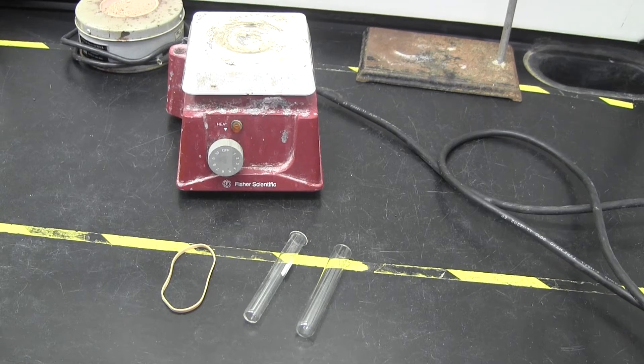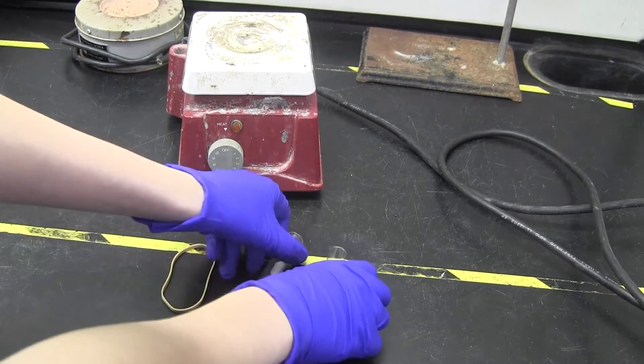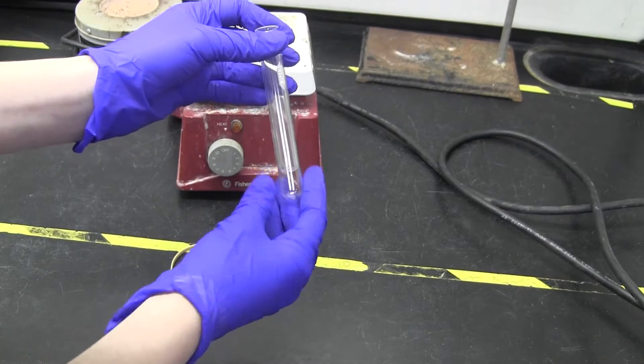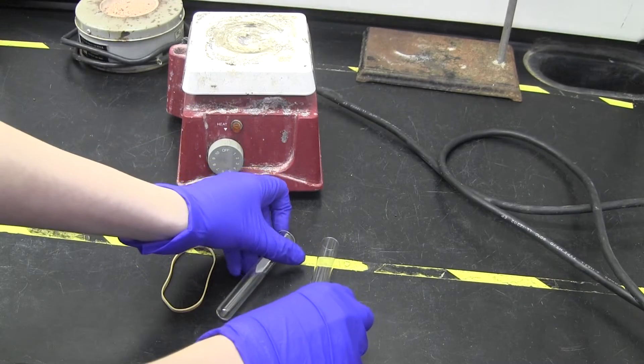First, you will set up the glassware. This is done by finding two test tubes that vary slightly in size. One test tube should be able to fit inside of the other, leaving a small gap.